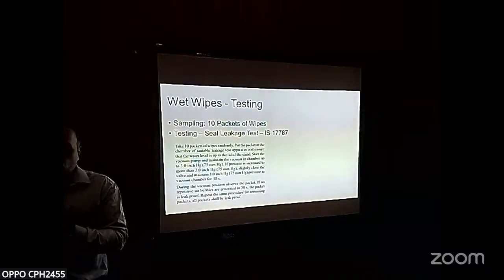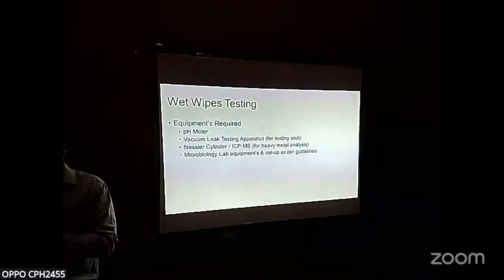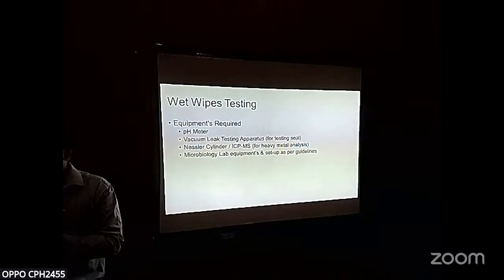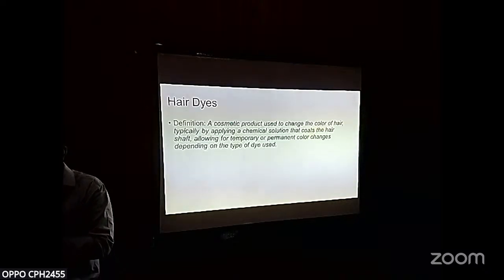We need to even look into how the sealing and everything happens. So these are the basic equipments which are required. Not much. Only the vacuum leak test is something very specific. I think many of the pharma manufacturers and the wipes manufacturers will also be happy with that.